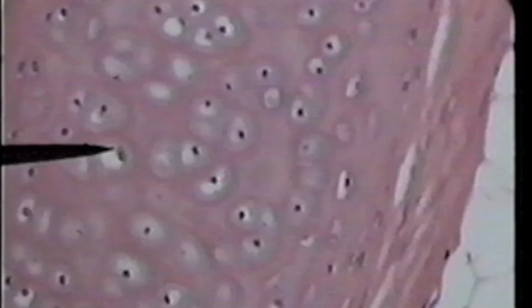Chondrocytes can be recognized because they are found in the interior of the cartilage and they are nice, round cells. The tip of the pointer here is on another cartilage cell, but this one is found on the periphery and is given a different name. This particular cartilage cell is called a chondroblast. Its job is to secrete cartilage on the periphery, while the chondrocyte maintains the cartilage in the interior. So look for chondroblasts on the periphery.